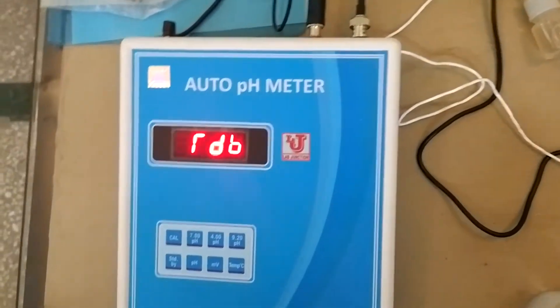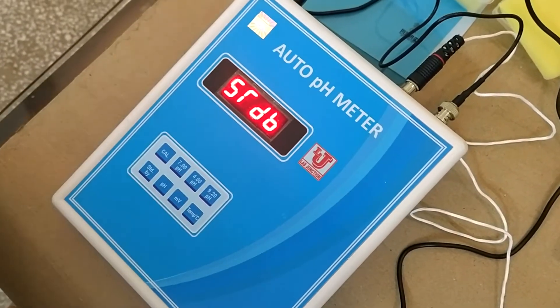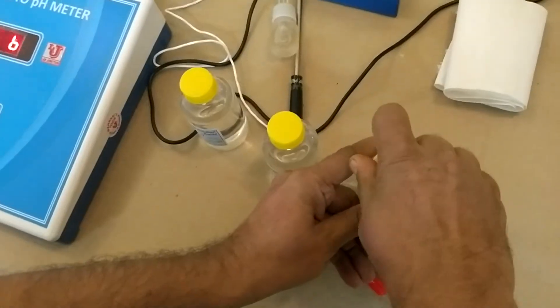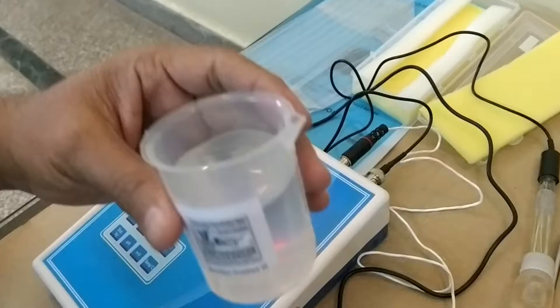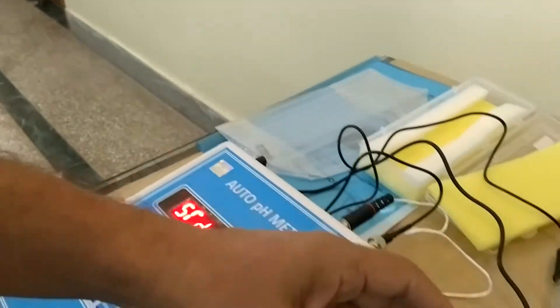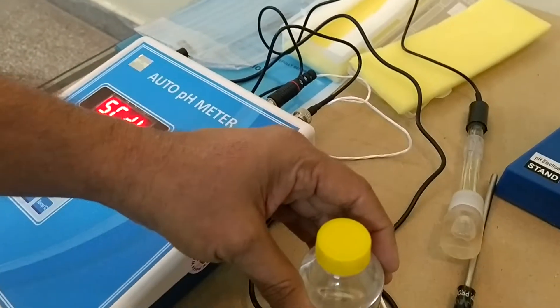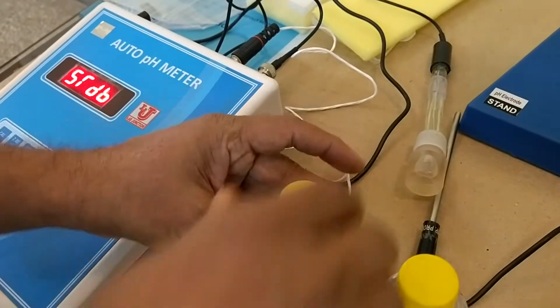First of all it shows standby mode. Now take your buffer solutions. This one is the distilled water. Always use double or triple distilled water for standard solutions, or if you have it, use HPLC grade distilled water; otherwise, use double or triple distilled water.